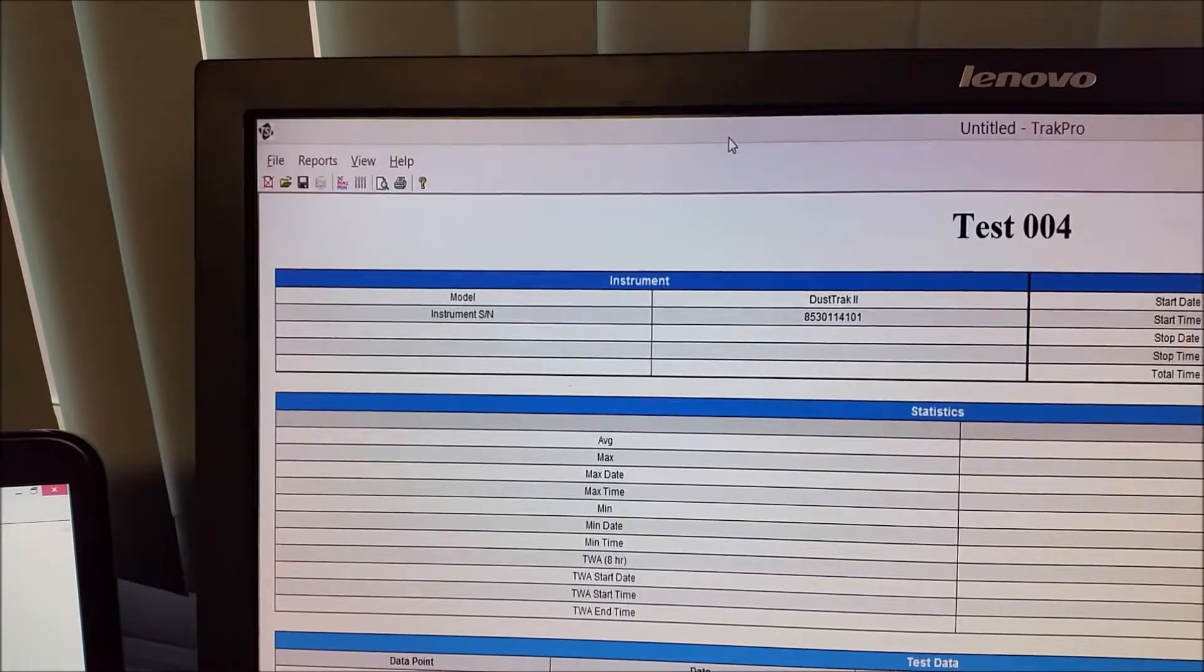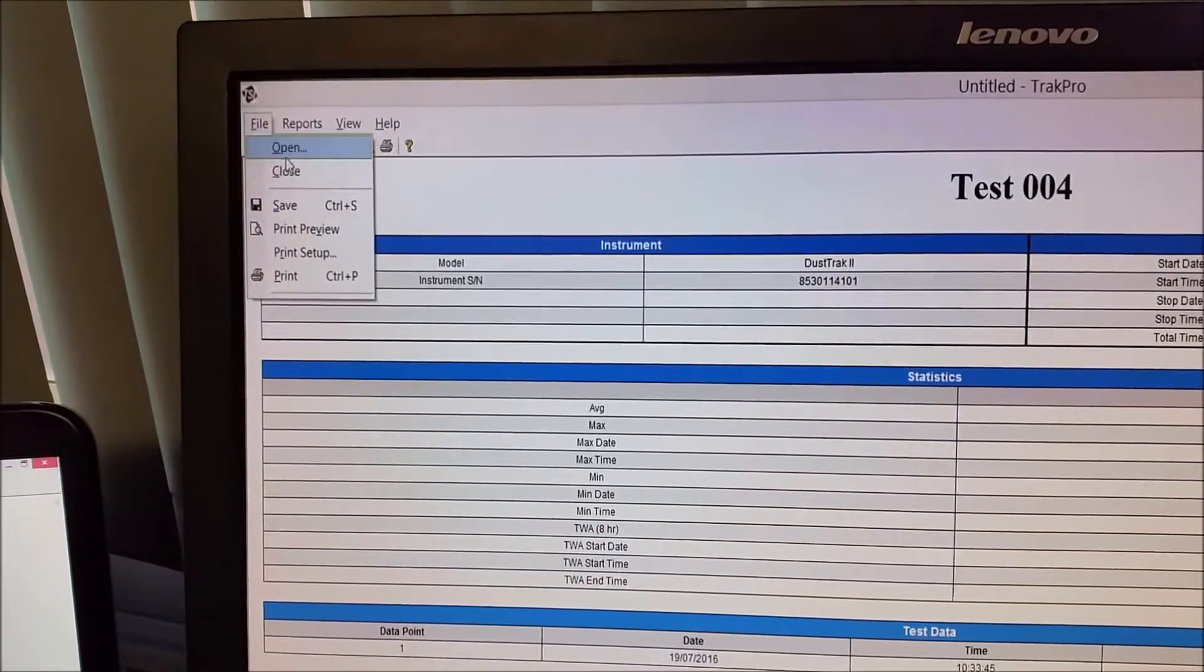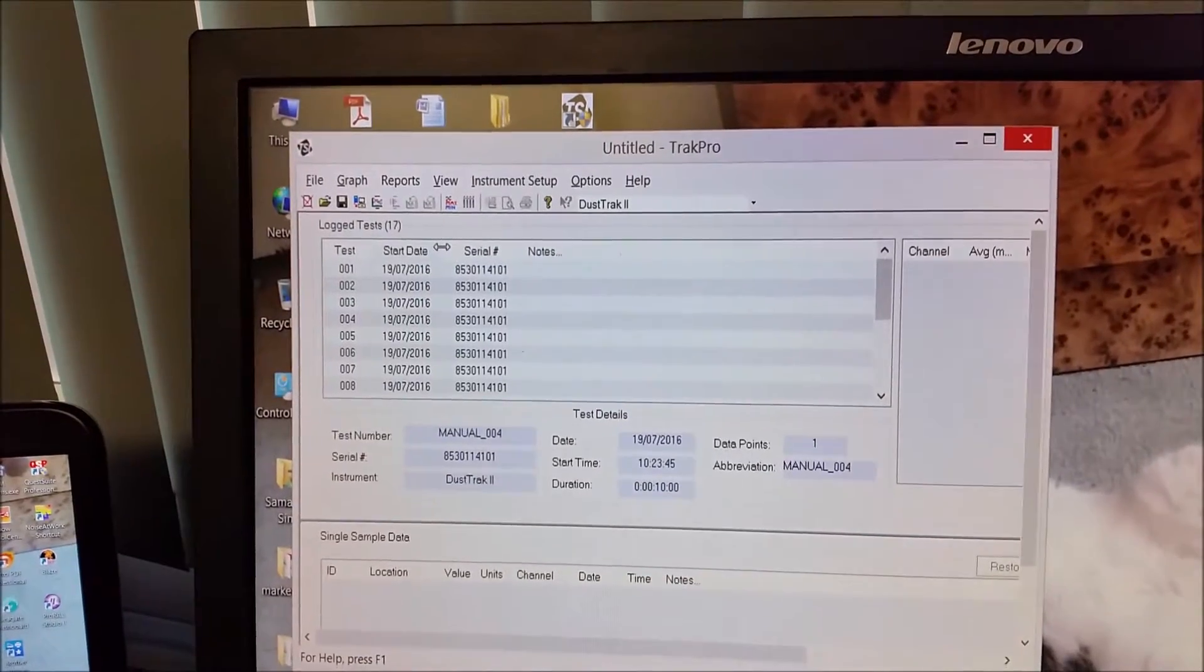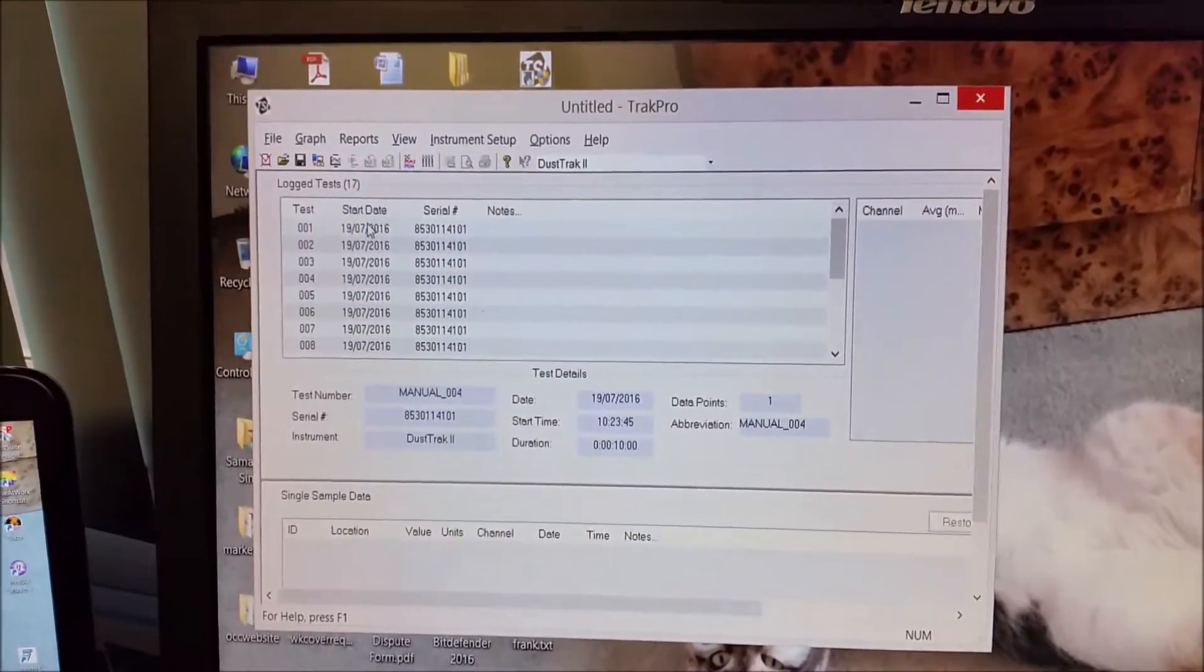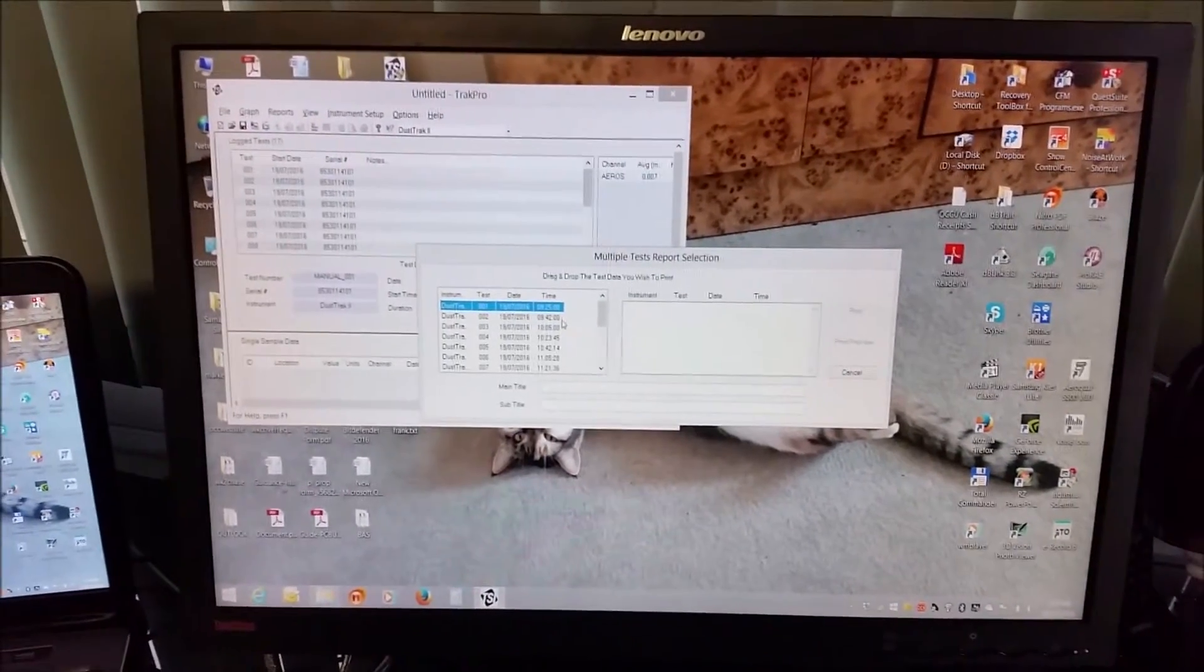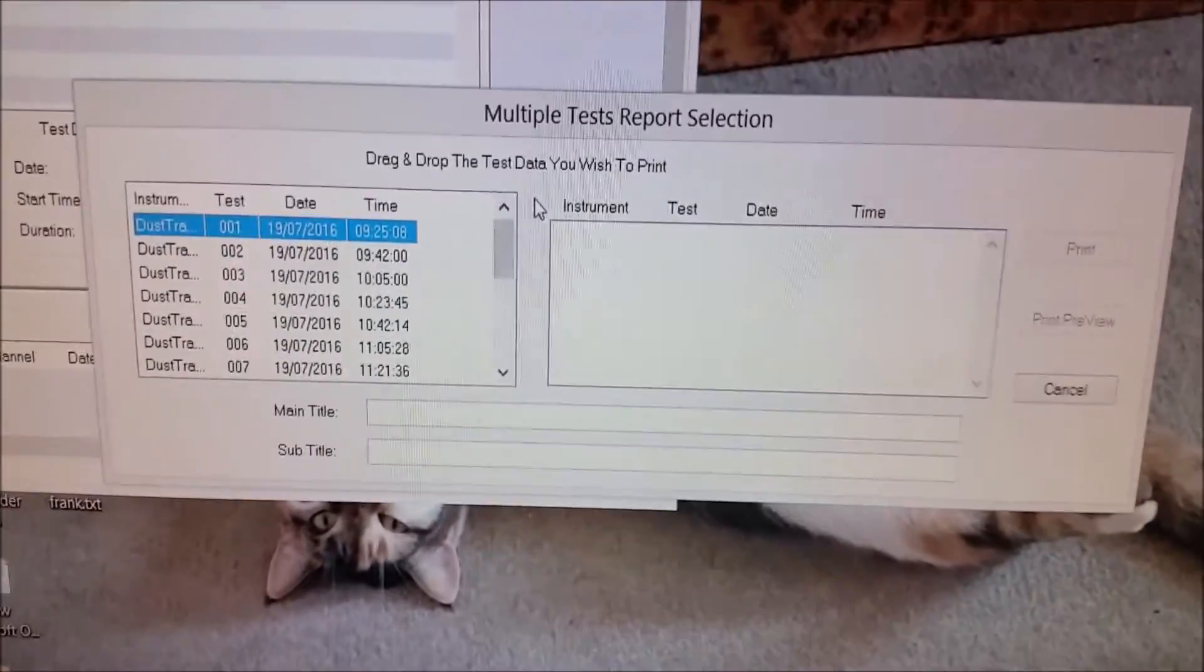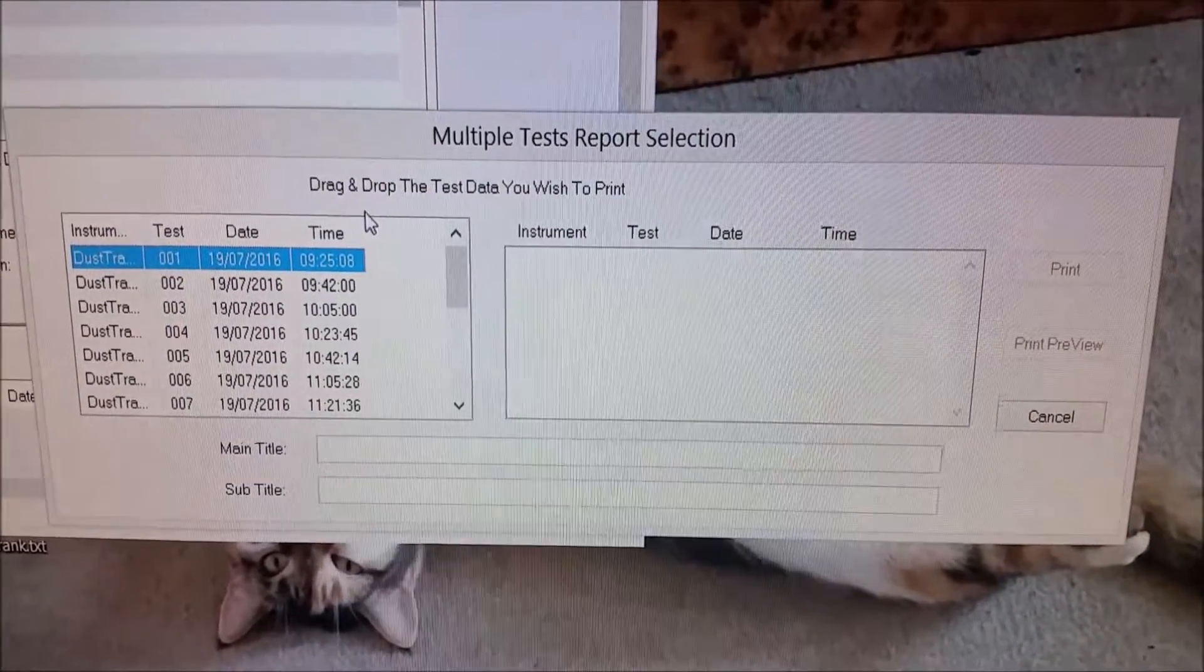If we want to do multiple data points in the one report, we can do that as well. So, to do a multiple test report, we go into the print icon. We go into multiple test report selection.